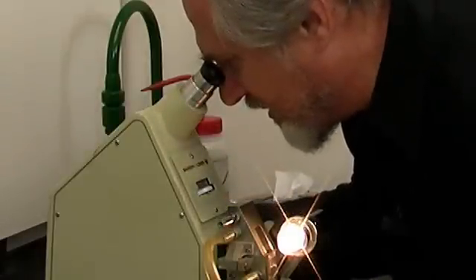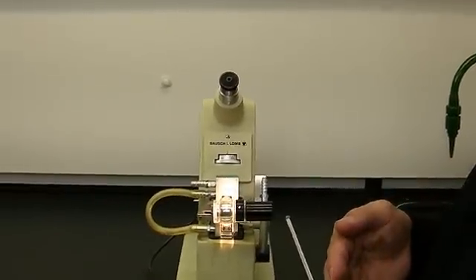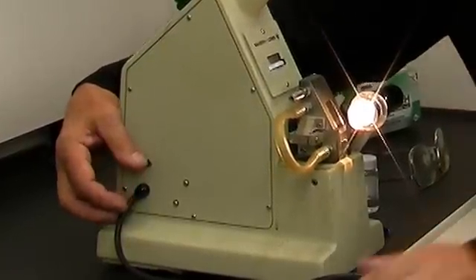We now have all we need to take the refractive index. We're going to take the toggle switch on the left and push it down — that's going to turn the lamp off and illuminate a scale on the inside of the instrument. We're going to read the top half of that scale. I push it down and I see the number 1.5134.